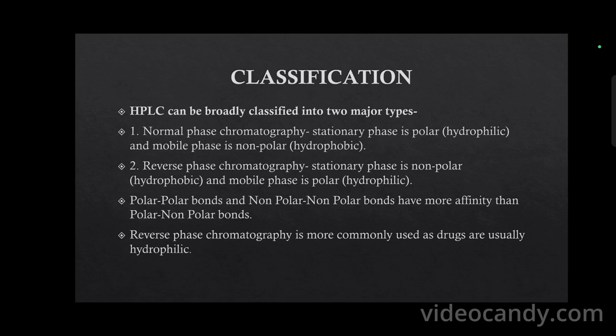Polar-polar and nonpolar-nonpolar interactions have more affinity than polar-nonpolar interactions. Reverse phase chromatography is more commonly used as drugs are usually hydrophilic.